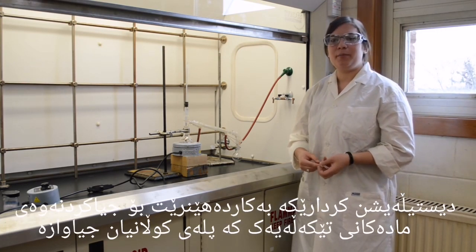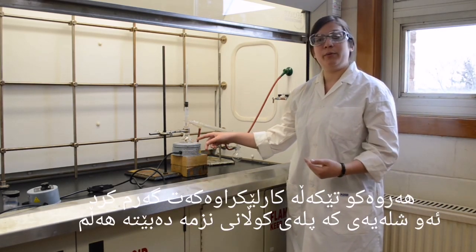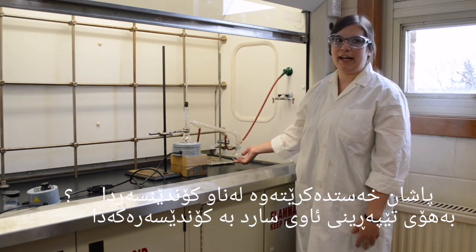Distillation is a technique which can be used to separate a mixture of solutions that have different boiling points. As your reaction mixture is heated, the liquid with the lowest boiling point will be vaporized and condensed through the condenser by cold water, and is then collected in a receiving flask.